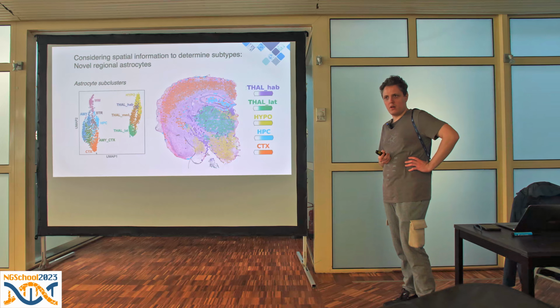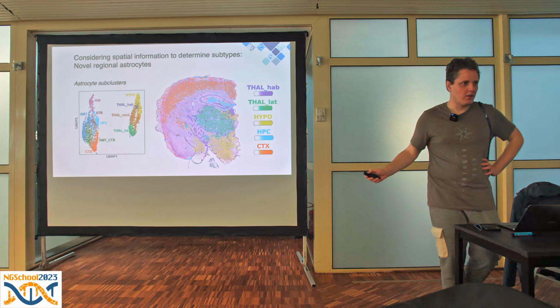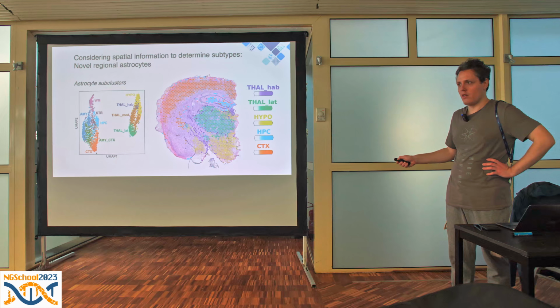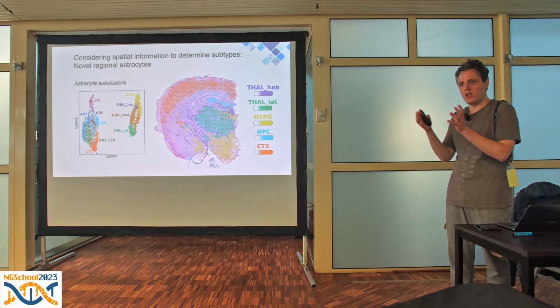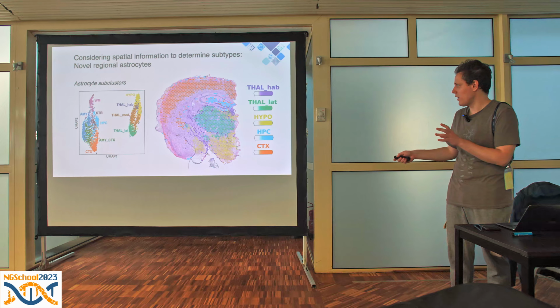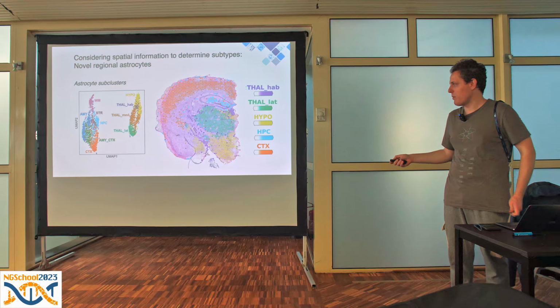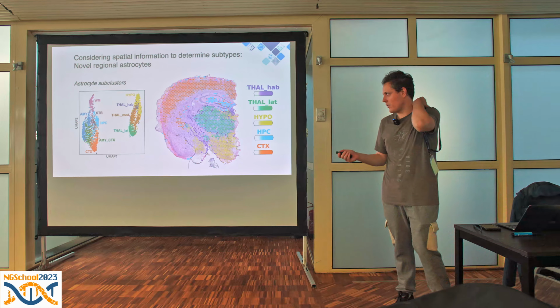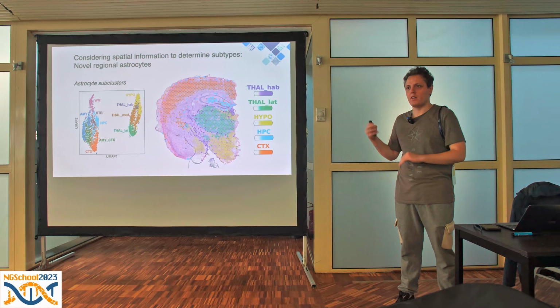We try to check whether the groups which are scattered throughout the brain differ. The way the method works is that we define a reference, we compute average abundance of RNA in the reference, and we then ask where are the cells with that average abundance present in the tissue. We don't have cells that correspond exactly to this area. We can stratify habenula astrocytes into the ones that are here and the ones that are in the correct area, and that information isn't in the reference. So you can interpret this as errors in mapping, or maybe transcriptional similarity of these astrocytes to white matter. It's not how this technology works.